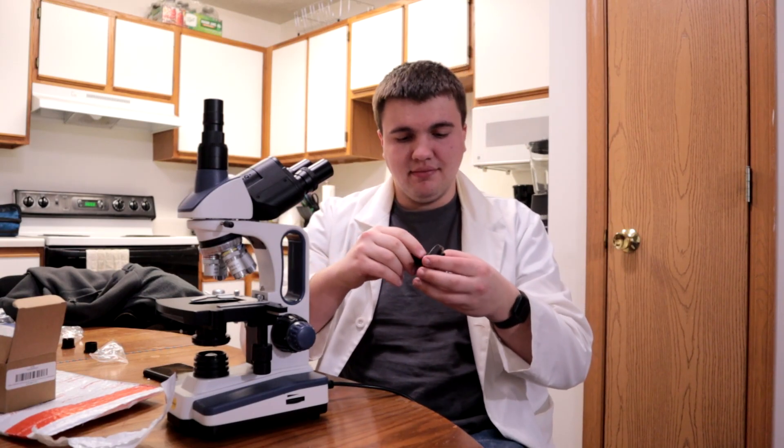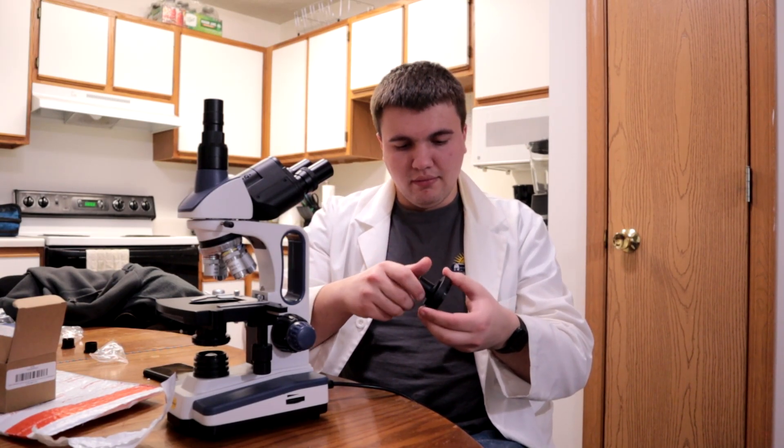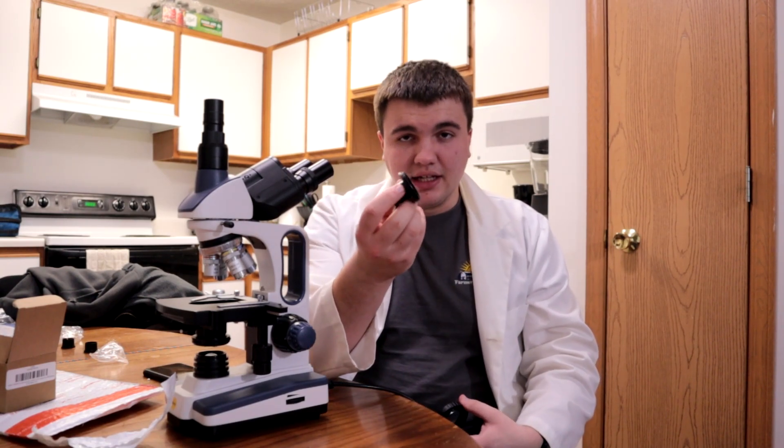Basically, I already own something like that — this thing — which we've used in the previous videos to capture footage from this. However, it didn't fill the whole frame and had some other issues. Mainly, when this was in focus, the eyepieces were out of focus. And when these were in focus, this was out of focus.